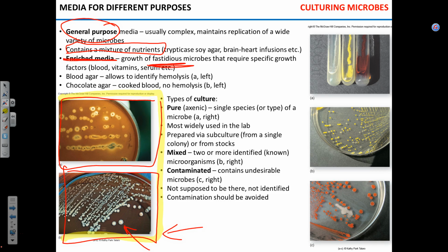Okay. Now, Neisseria will not grow on the TSA successfully. You have to give it cooked blood. This, it's okay. Think about some of the national foods.